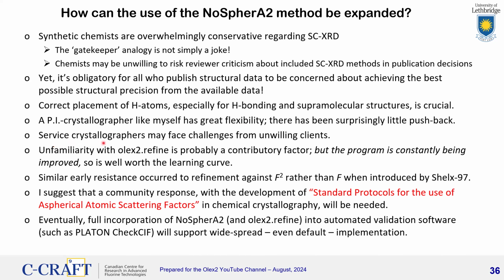So I explain myself well, but after that, there really has not been much pushback. Service crystallographers, on the other hand, may face challenges from unwilling clients simply because of these publication fears that they're having. That is a barrier that will have to be overcome. Among crystallographers, I think unfamiliarity with OLEX2 Refine is probably going to be a contributing factor. It was a factor for us, for sure.